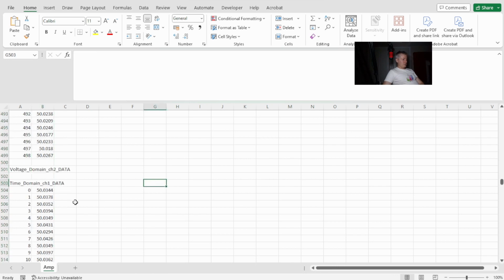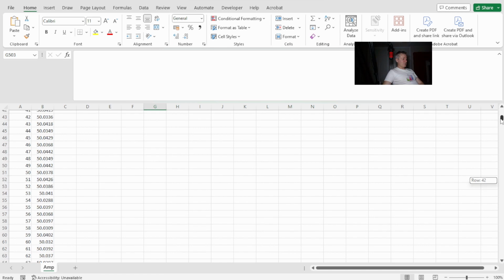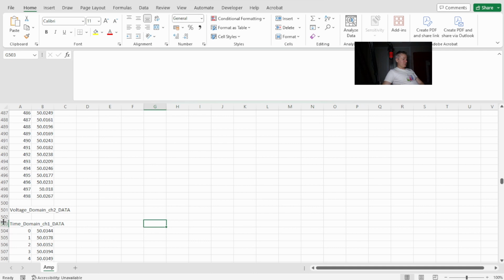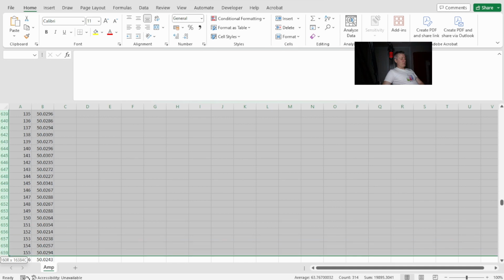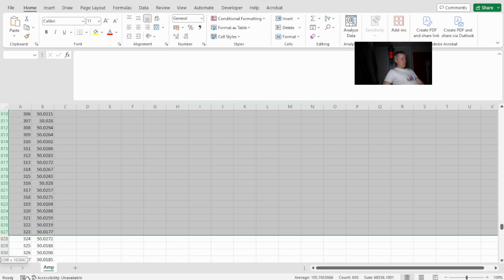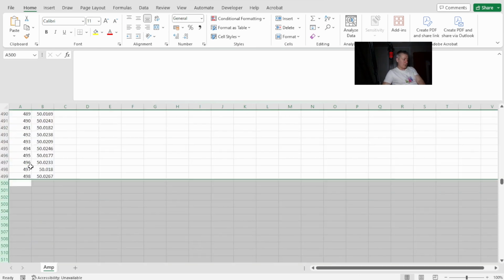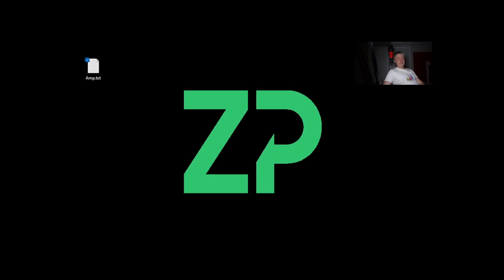Yeah, that's interesting. I've got a suspicion, I don't know why, but the way the data comes out, it comes out essentially twice from the potentiostat. Yeah, it's twice, so I'm just going to delete this here. So what you can see I've done is I've renamed the file format from GPE to text. I've gone in there and essentially cleaned it up, taking out a lot of what I think is unnecessary data at the top of it, and I've taken out one of the columns, and now I'm left with something, let's say, fairly clean. I've saved that, so that's the text file edited.